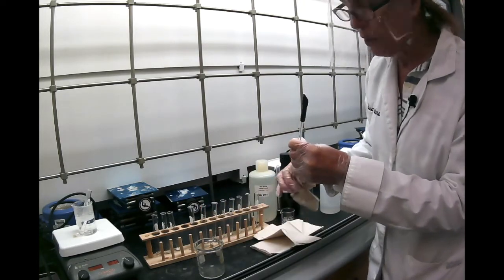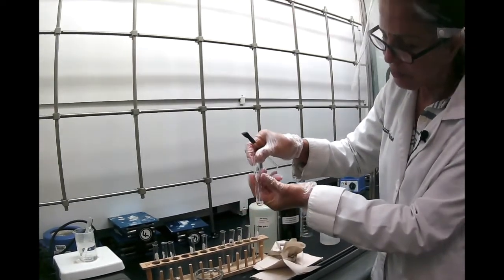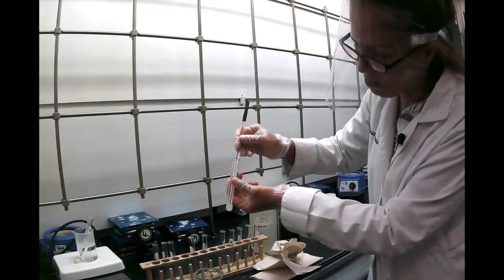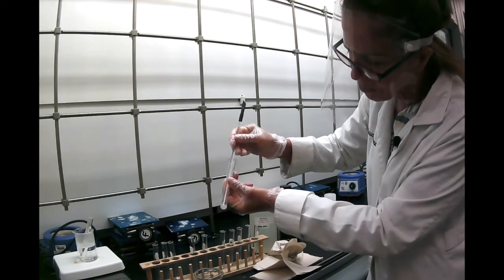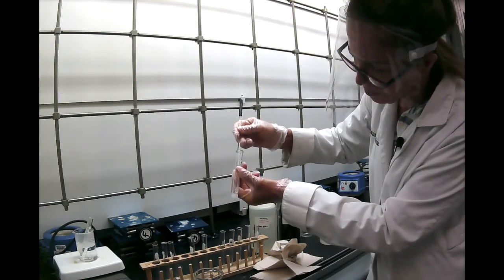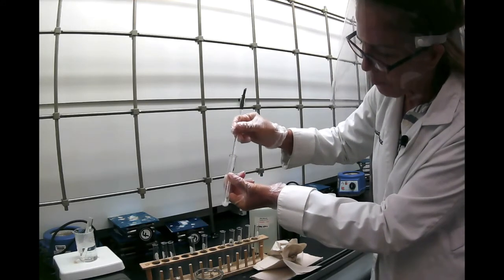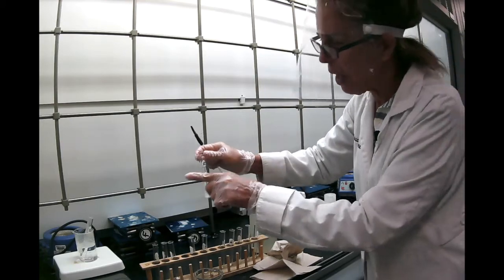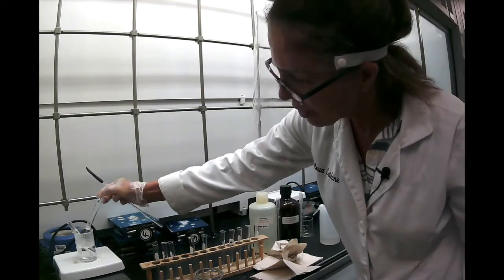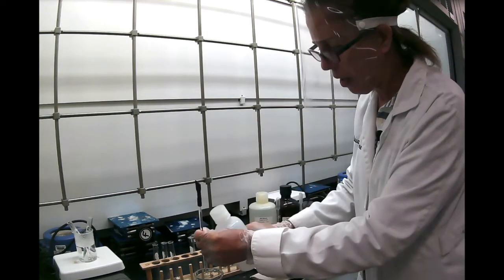Then the next one is benzoic acid. So here's my benzoic acid. They all have 0.1 grams of the substance, and they all have 1 milliliter of the solvent. You stir with the stirring rod, and it's obvious that it's not dissolving here. So I'm going to leave them in the hot water and see if they dissolve in hot water. I already have them marked: this is naphthalene, this is benzoic acid.